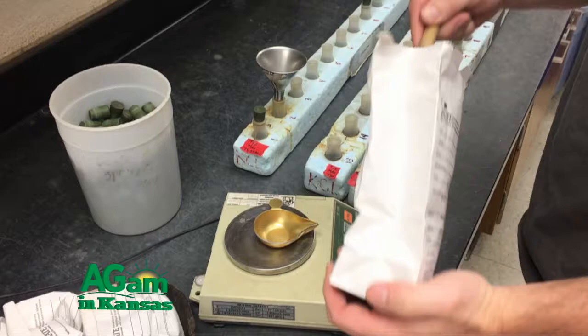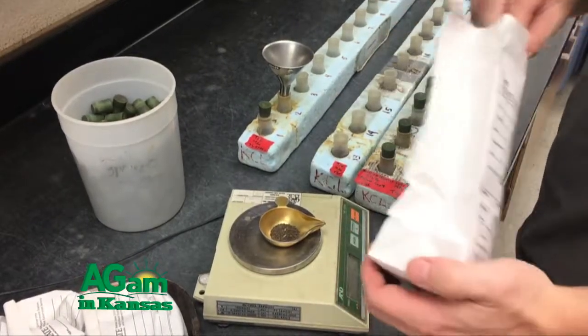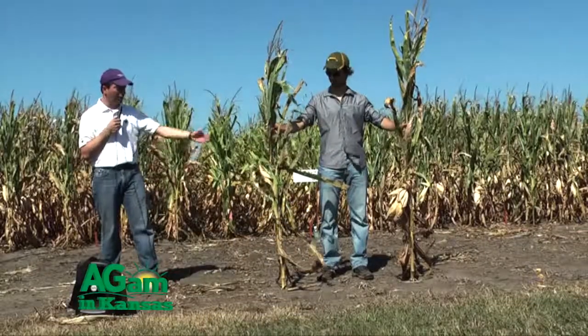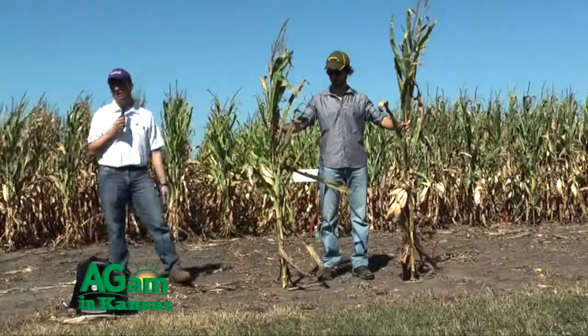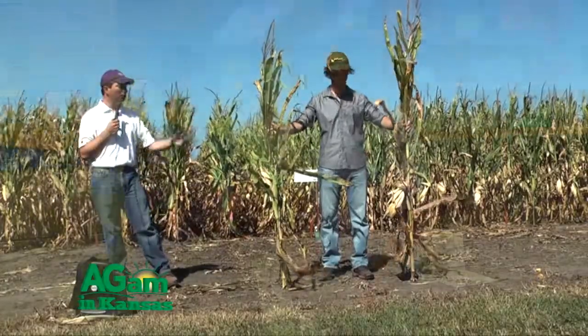Yes, a typical study will obviously evaluate, like you mentioned, multiple rates of nutrients, and we're talking about phosphorus, potassium, and so on. Basically, we want to be able to correlate the value of soil tests that we have with the response that we are seeing to fertilizer applications. And for that, we not only need multiple locations, but we also need multiple rates of fertilizer to make that evaluation in terms of the response.